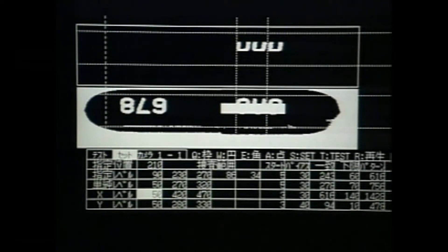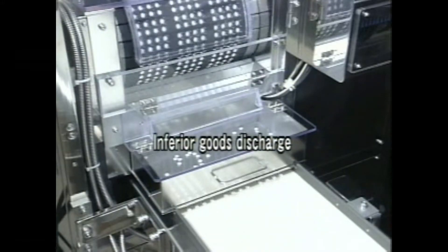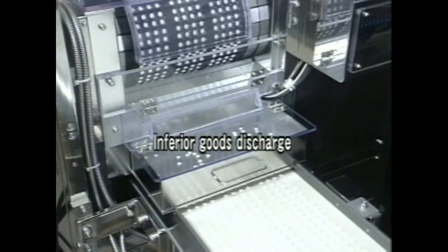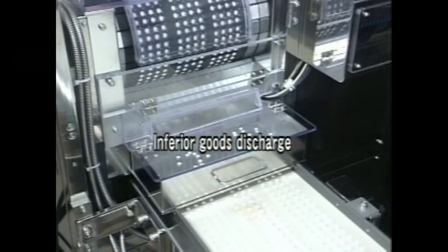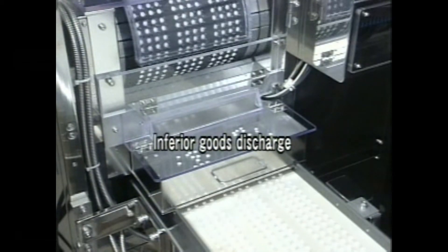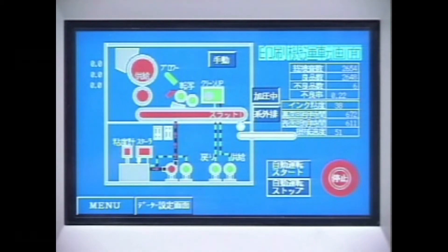If a product is defective either with respect to the printing, the content or the tablet surface, the defective tablet will be removed into the special box and the other good quality tablets will be picked up by the special belt. The IS500 is equipped with a device that performs validation, which permits us to ensure that the defective products have really been removed.